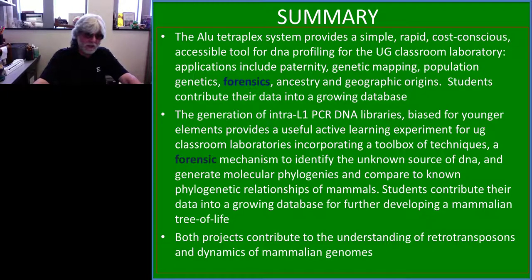Okay. For the intra-L1 DNA PCR libraries, I've shown that we had biased it for the younger elements. It's a useful learning experience with a whole set of molecular tools, and there's a forensic component as well as overall generating a mammalian tree of life component.